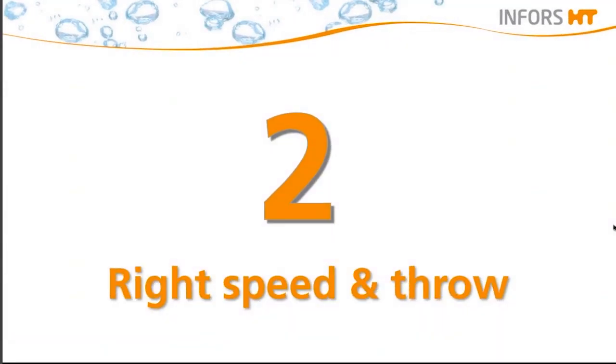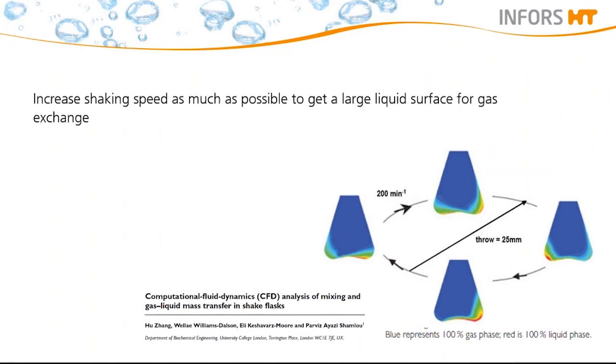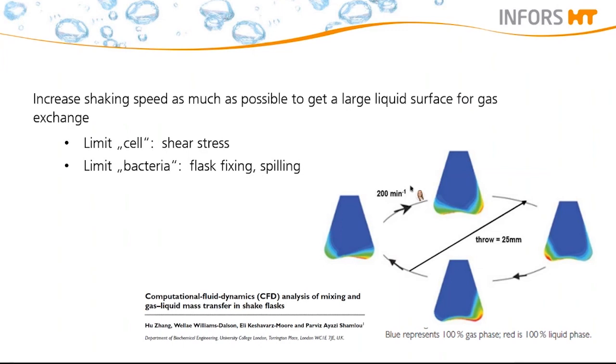Questions which arise are how to decide on the right shaking throw as well as speed for your shaking flasks. Often the reason for poor biomass concentration is not a clone, as you may think. External factors such as shaking throw in combination with the shaking speed have a big influence on the oxygen transfer. Here we show a computational fluid dynamic, so-called CFD study, of mixing and gas-liquid mass transfer on a shaken flask shaken at 200 rpm.